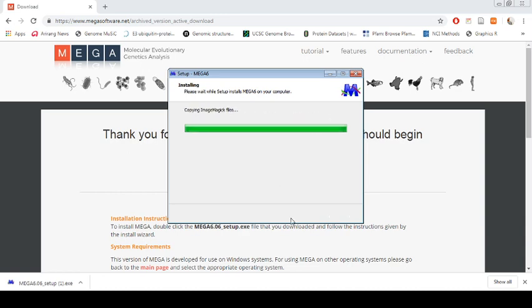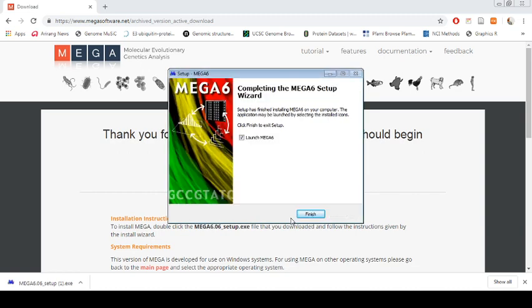Now it's almost done. Now you are ready to use MEGA software.